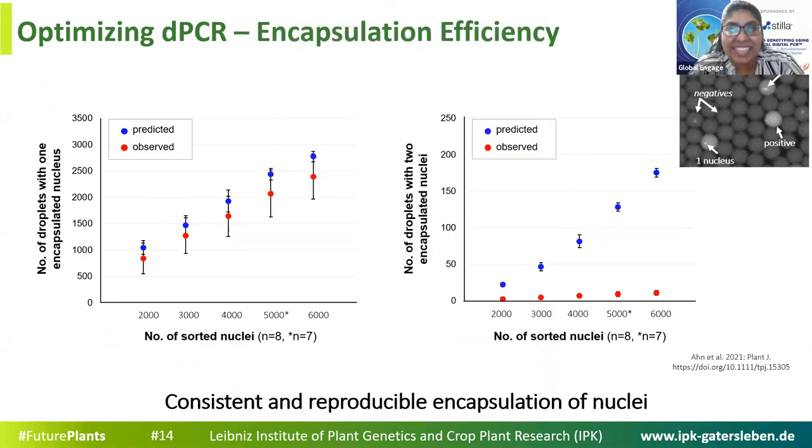Okay, thank you. And the next question is for Jay. How were the droplets counted, manually or digitally? He's referring to slide 14. Yes, they were digitally counted at first, but I was also checking them manually. It sounds laborious, but it's not really laborious because you can very easily see them under the HEX channel. They were manually and digitally checked.